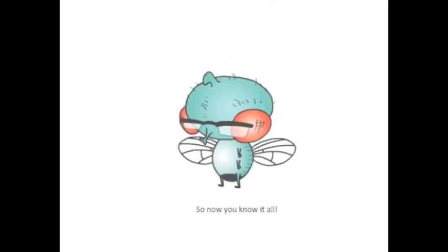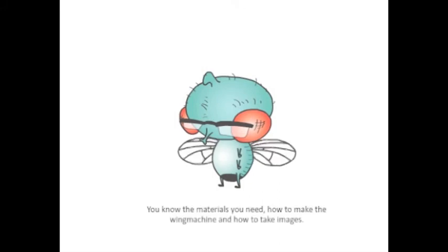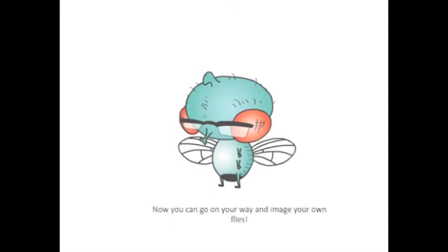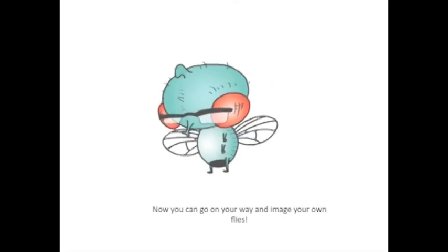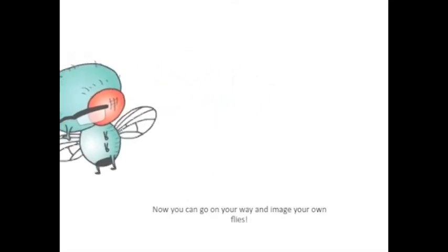So now you know it all. You know the materials you need, how to make the Wing Machine, and how to take images. Now you can go on your way and image your own flies. Thank you very much.